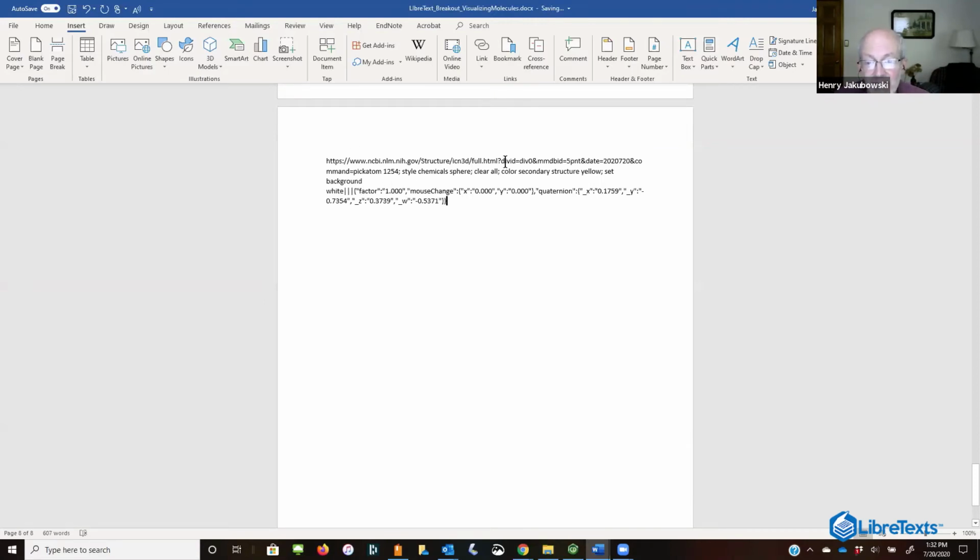And it tells you a couple of things. It's like the link. Here it says that I have a file. It wasn't a PDB file. It was an MMDB file, which has different sorts of information on it. But anyway, here it all is. So I'm just going to hold that there for a while.